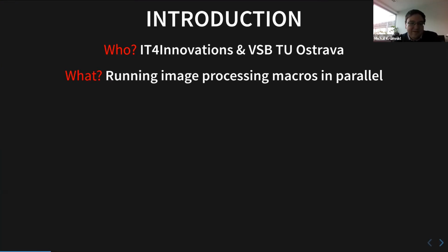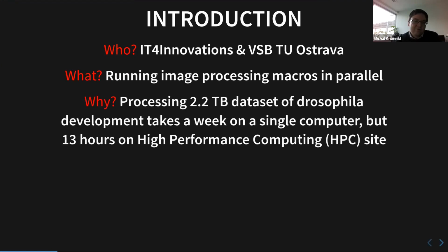We have prepared a set of tools with a graphical interface that we will be working with. It's fully integrated into Fiji, so we'd like to make it as easy as possible, and we will show you how to use them. But maybe before, you may ask why make it so complicated? And I think the reason is obvious.